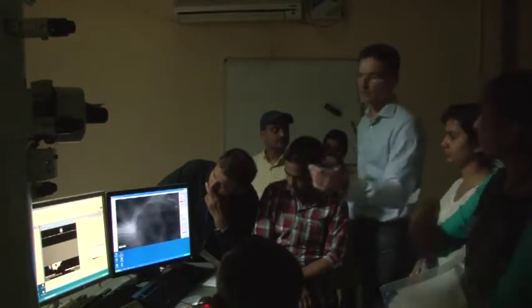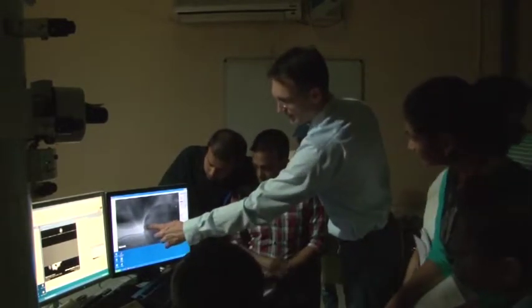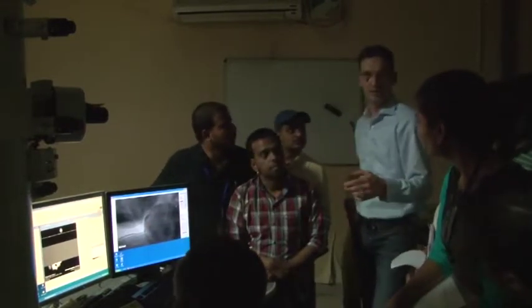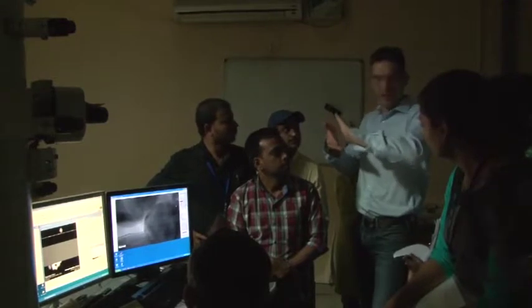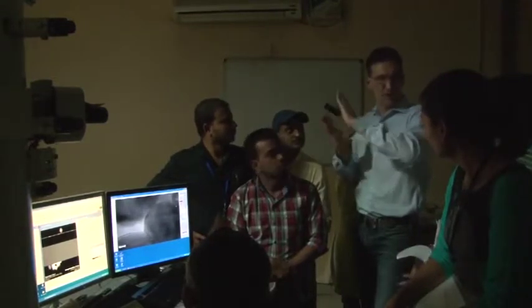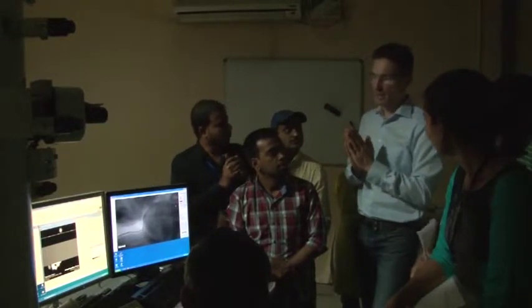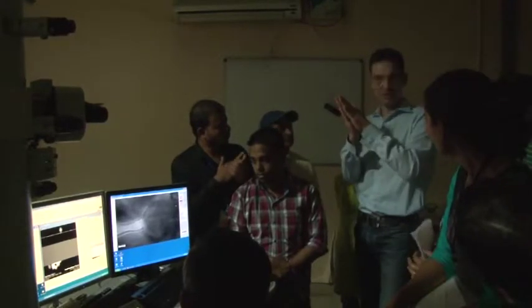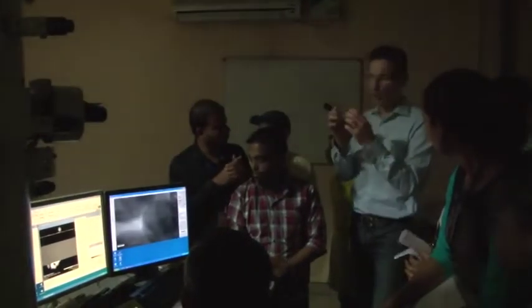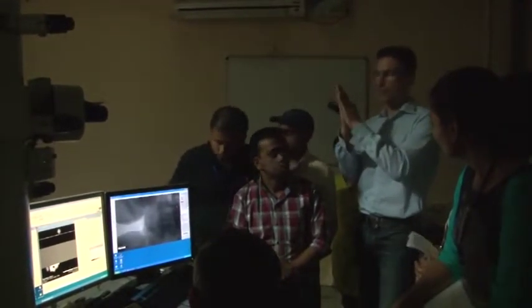This is a disadvantage of a microscope without an aberration corrector: these delocalization effects. You saw this diffracted intensity with this brighter shadow, this ghost image that was shifted. You don't have the best resolution at zero defocus where they match, but you go to under focus, and you always have the shadow images of these diffracted contributions slightly shifted.